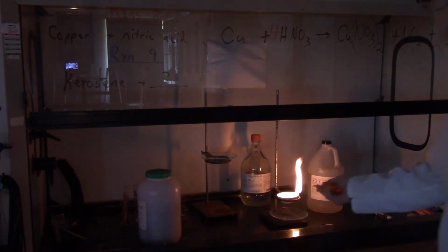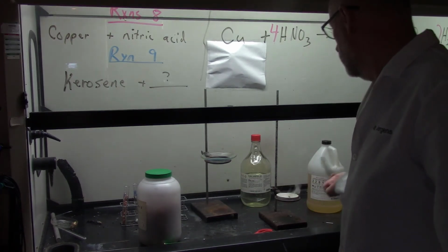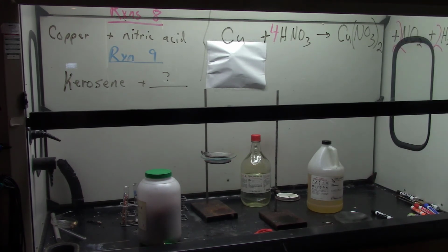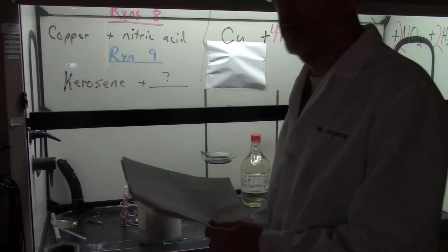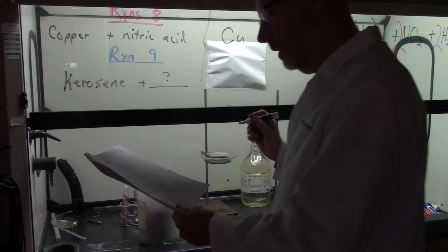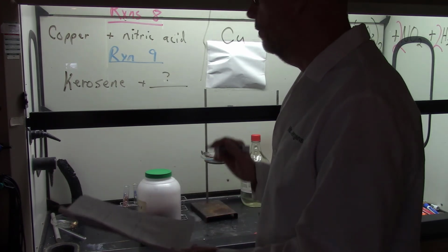There's a chemical reaction going on there, and let's see if we can figure out what that reaction is. Put out the flame by taking away the oxygen. So now the reaction cannot proceed without oxygen. That's a fundamental way to put out flames. Kerosene is a petroleum product. So it comes out of the ground, people pump it out of the ground along with gasoline, and it's a big mixture of lots of different things. With kerosene, we mostly have 3 types of molecules, C12, C13, and C14.